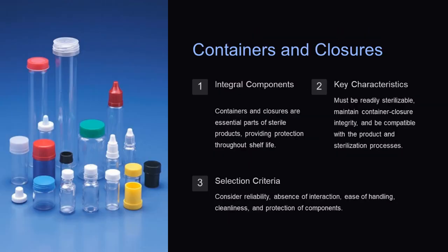Containers and closures are essential parts of sterile products, providing protection throughout shelf life. Key characteristics include reliability, maintaining container closure integrity, and compatibility with the product and sterilization processes. Selection criteria consider the absence of interaction, ease of handling, cleanliness, and protection of components.